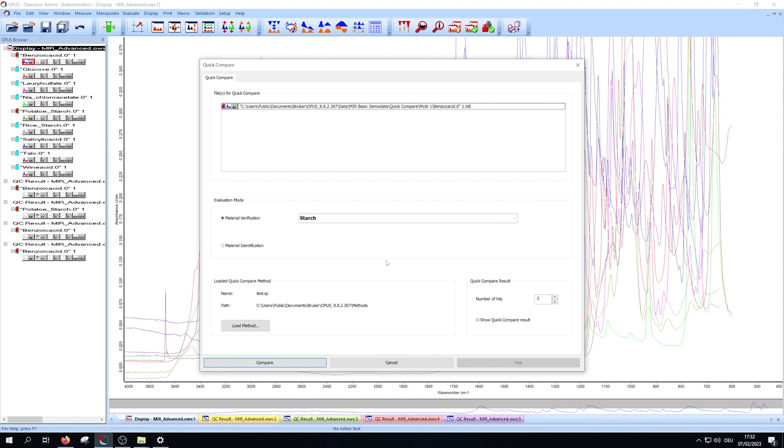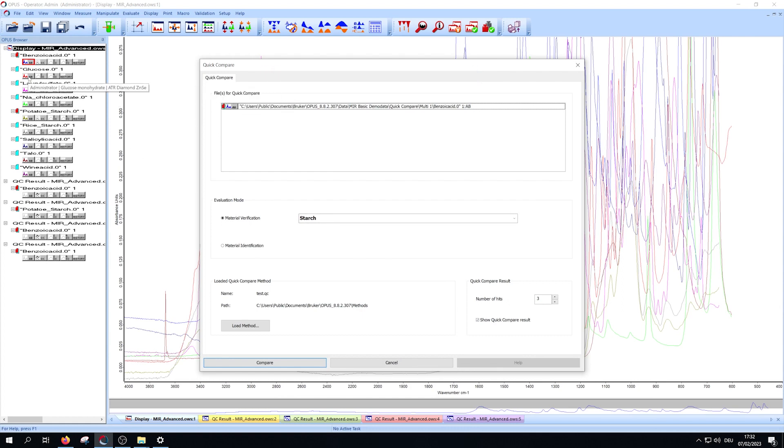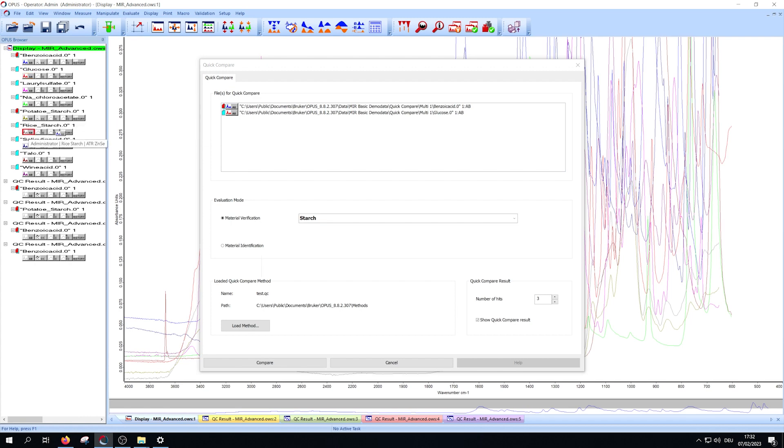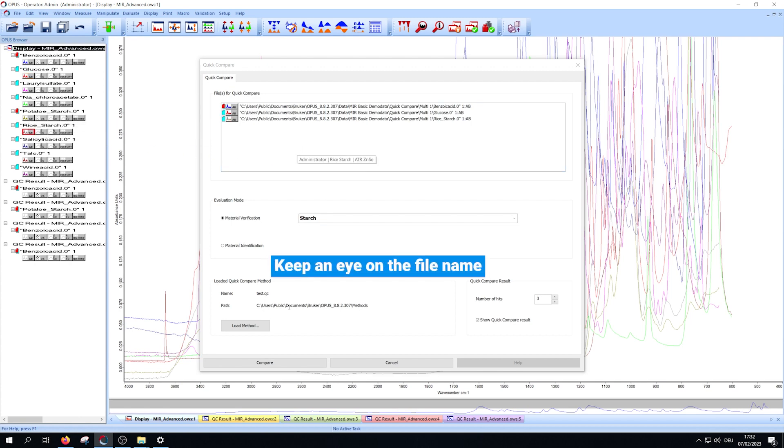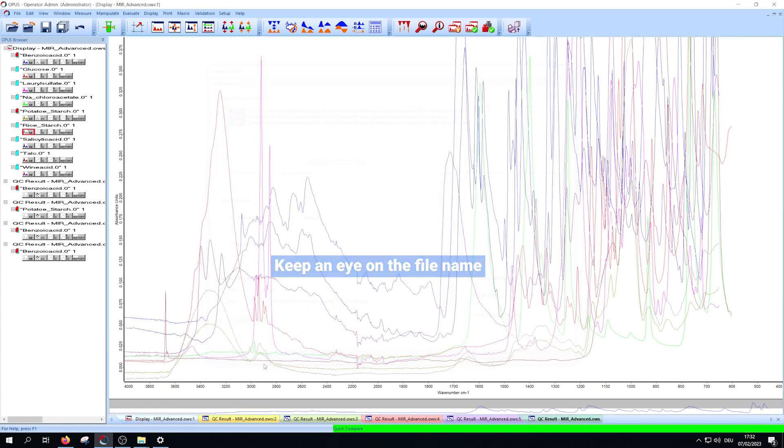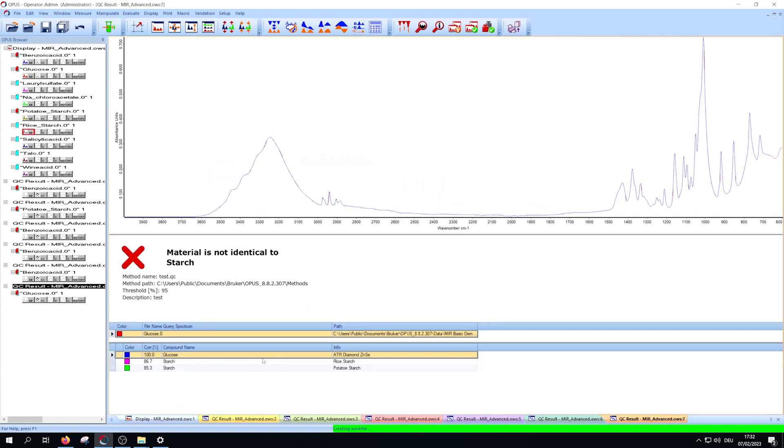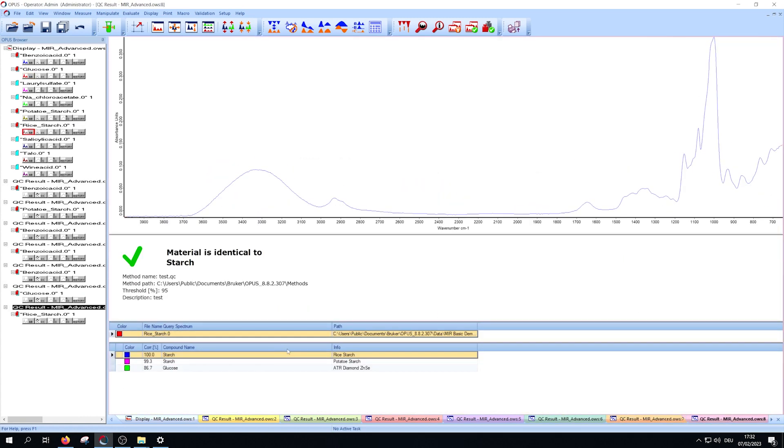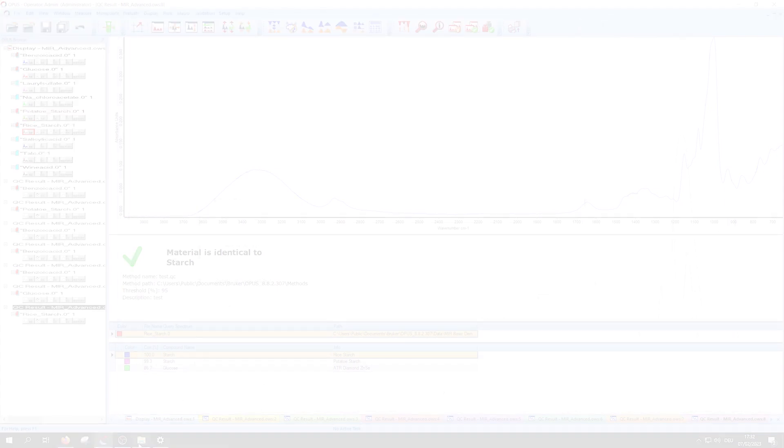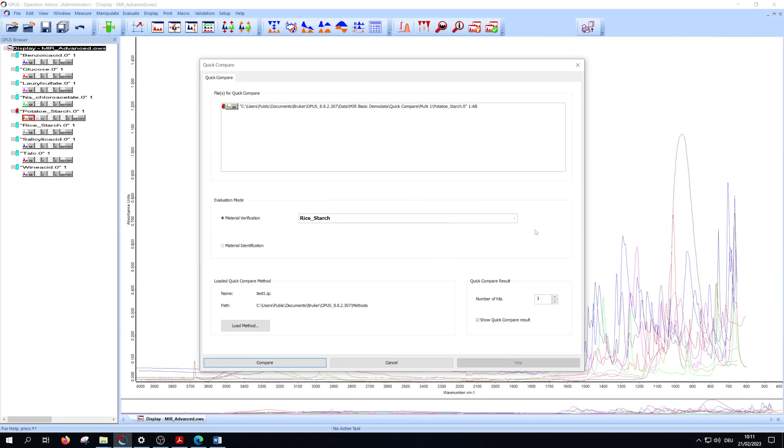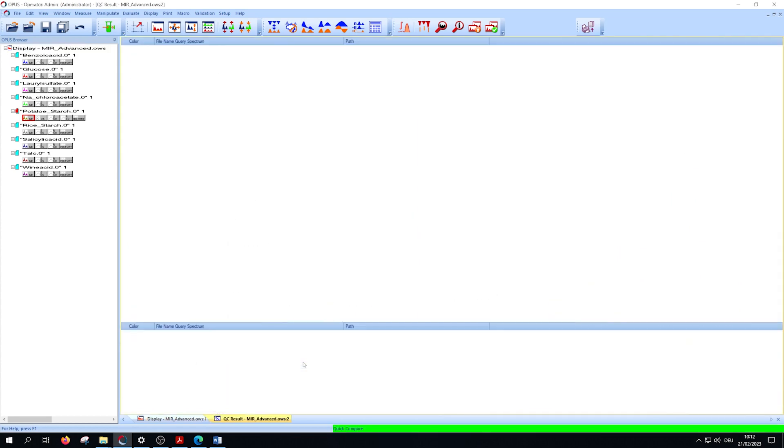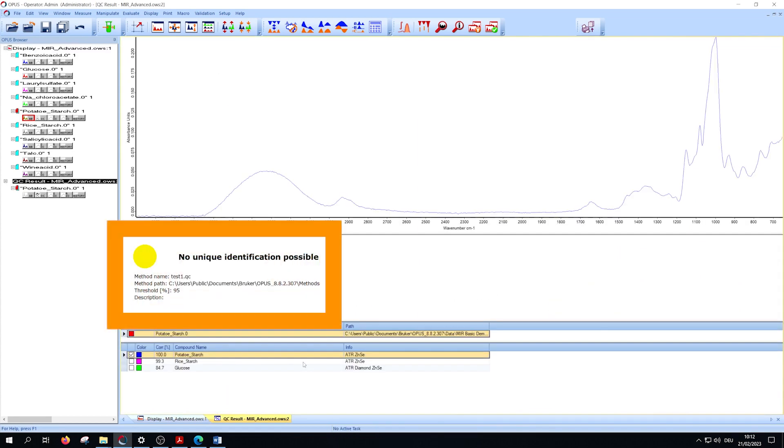You can verify multiple samples at the same time, but keep an eye on your file names to clearly distinguish them. If multiple method spectra are above the threshold, you will get the yellow result 'no unique identification possible.'